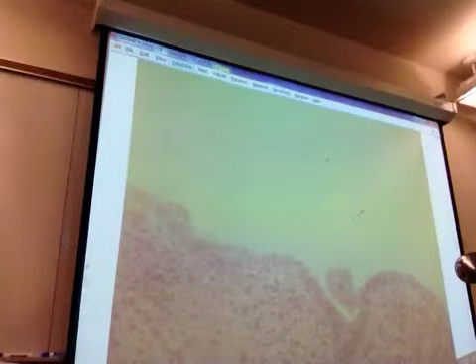It didn't look like this though. I haven't seen any cilia. There's no cilia in the uterus. It's only in the fallopian tubes. It is simple columnar epithelium. That's what Wikipedia says as well.